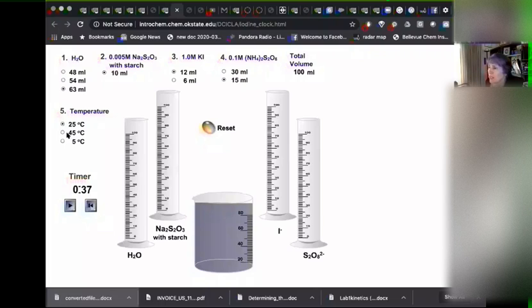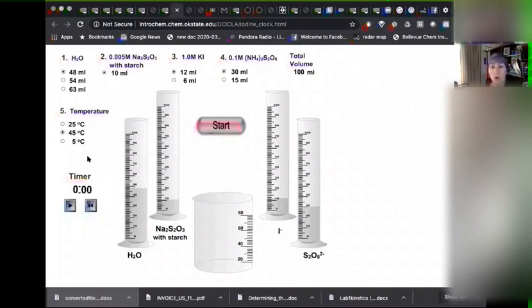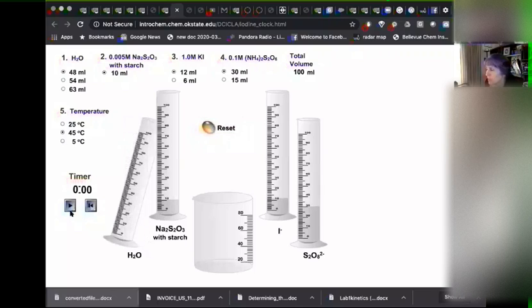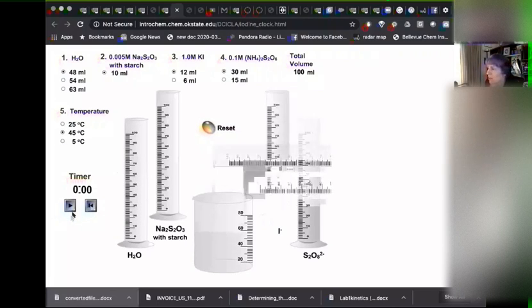Now we could do it. Let's change the temperature here. Oh, I got to reset it first. I'm going to change it to the warm one. Now we're doing the temperature study and it went back to the original solution, which is the same as the way our lab is designed. So I'm going to click start. Once all the solutions in there, then I have to click the stopwatch.